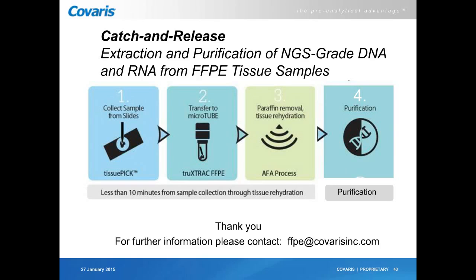All right. When in the protocol is there tissue rehydration? Tissue rehydration is just after, and actually almost simultaneous to, the paraffin removal. When you start with FFPE tissue in the Covaris microtube, you have this aqueous solvent, and you deliver the acoustic energy. This shearing force will remove the paraffin. As you remove the hydrophobic paraffin, in the meantime you push the aqueous buffer into the tissue, and then you have this tissue rehydration. So it's really simultaneous: you remove the hydrophobic paraffin and you push the buffer into the tissue.